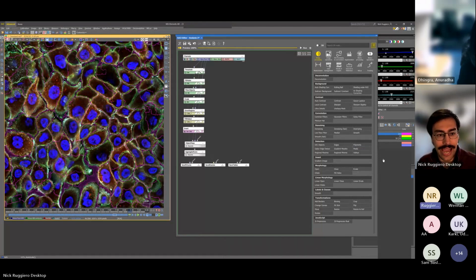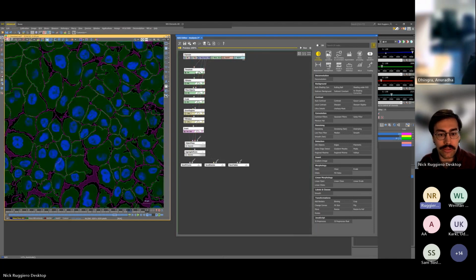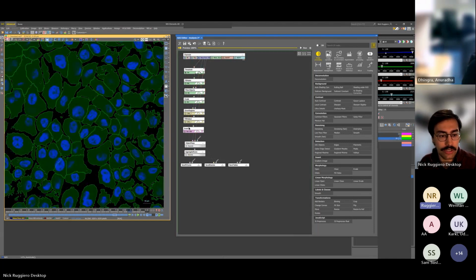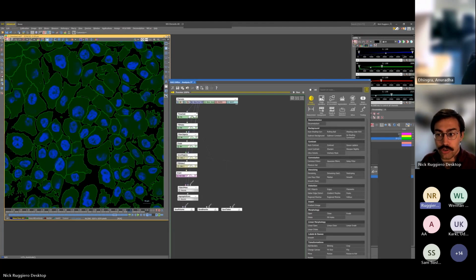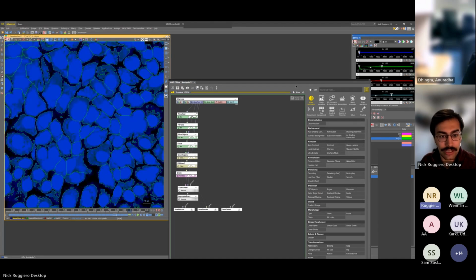So not all the GA3s have to be extremely complicated. If you'll notice, if you look at all my connections here, I ran all of this off the DAPI channel. So I pretty much worked here. The first thing I did was threshold out all my DAPI cells. DAPI is usually a really good channel to threshold from, because if we adjust our lookup table all the way here, we can see that DAPI sort of just bleeds through into everything.